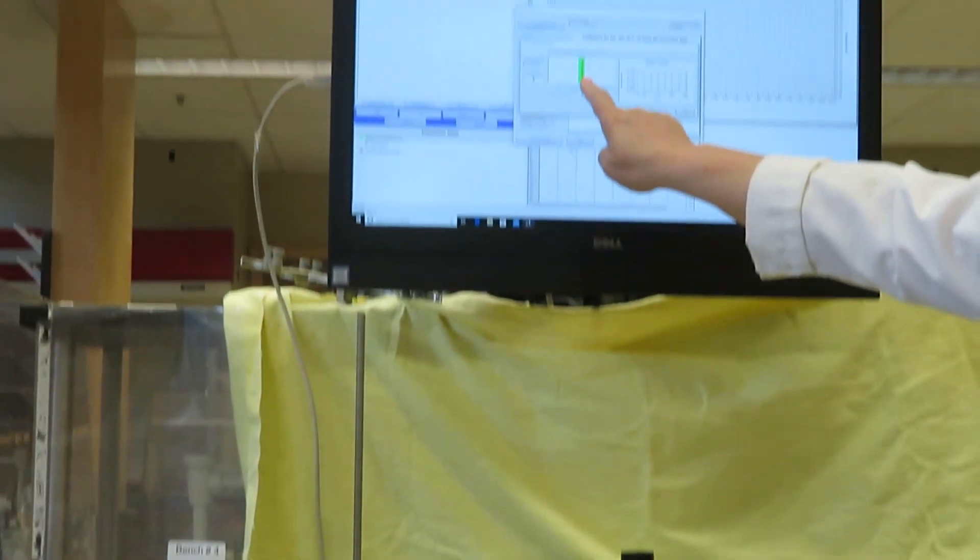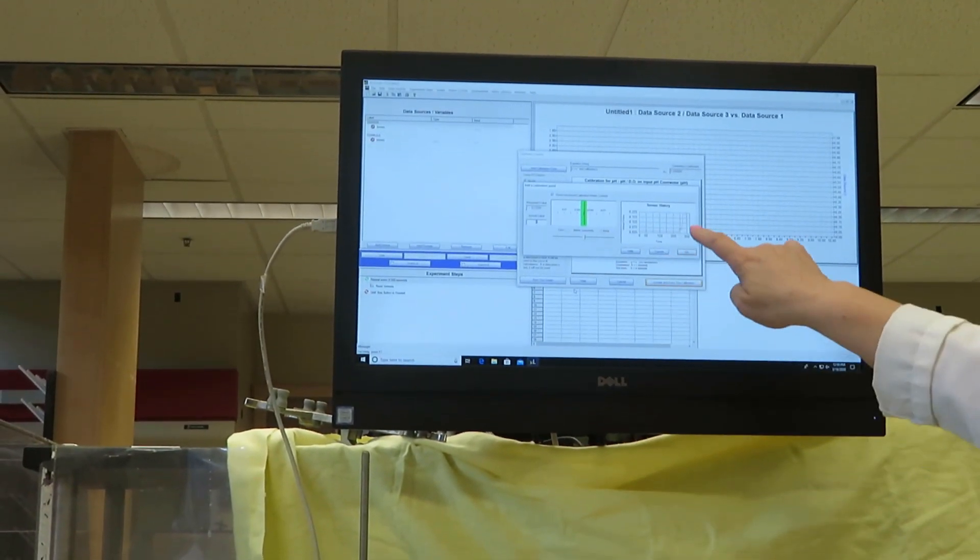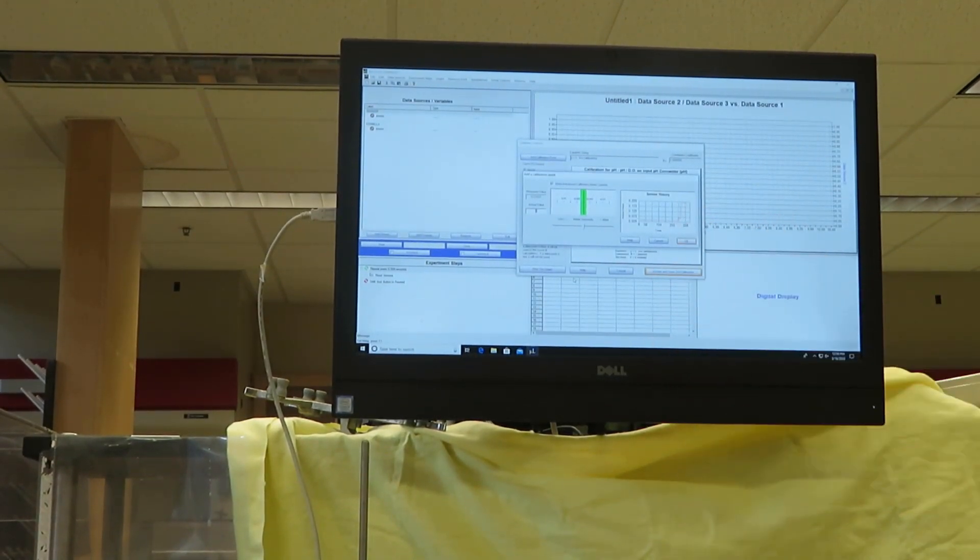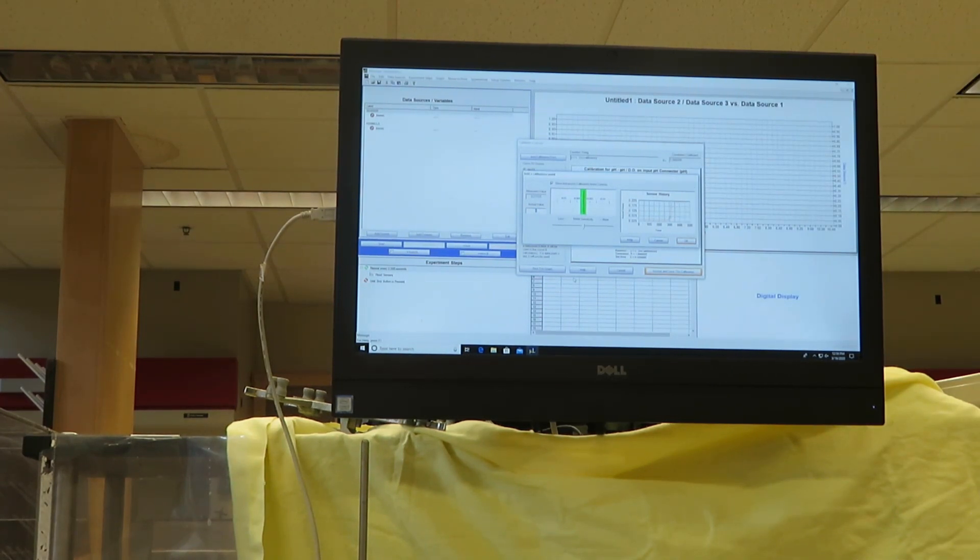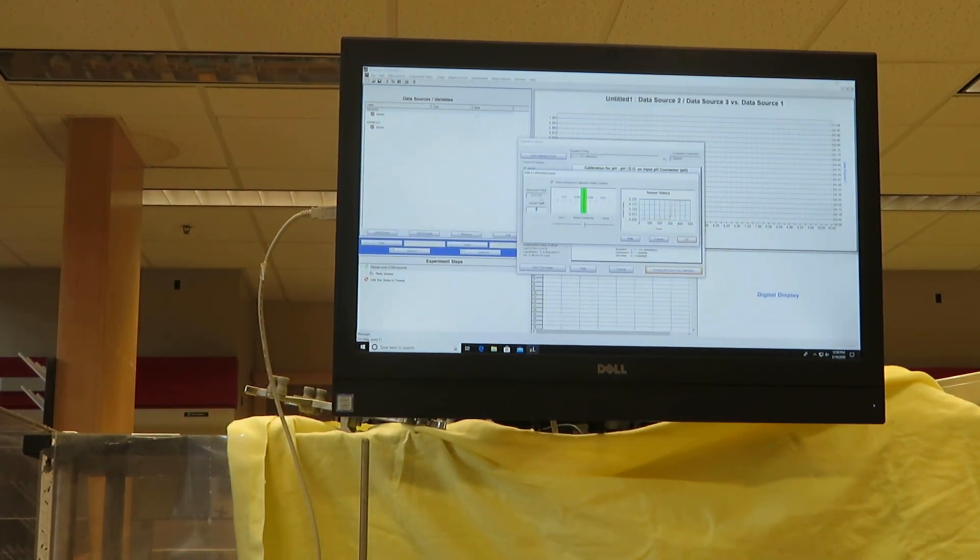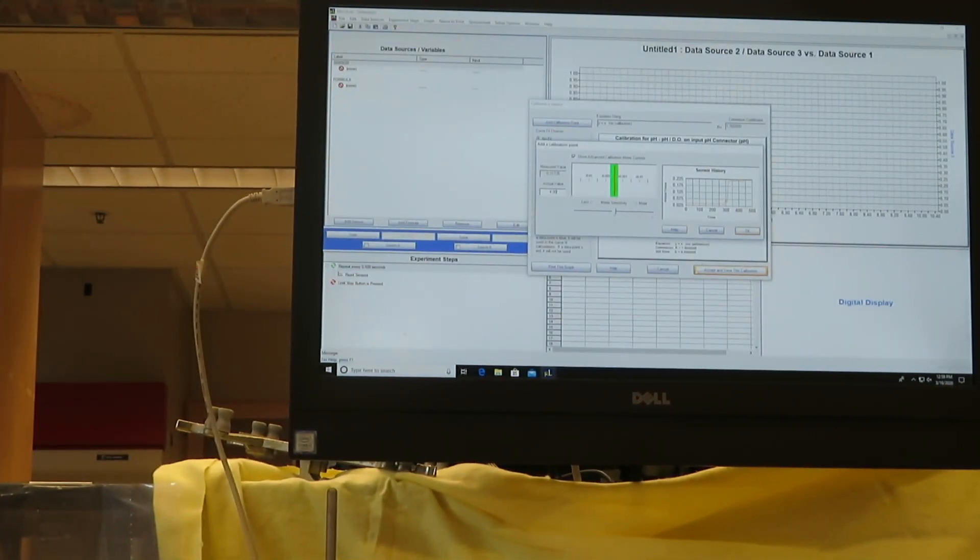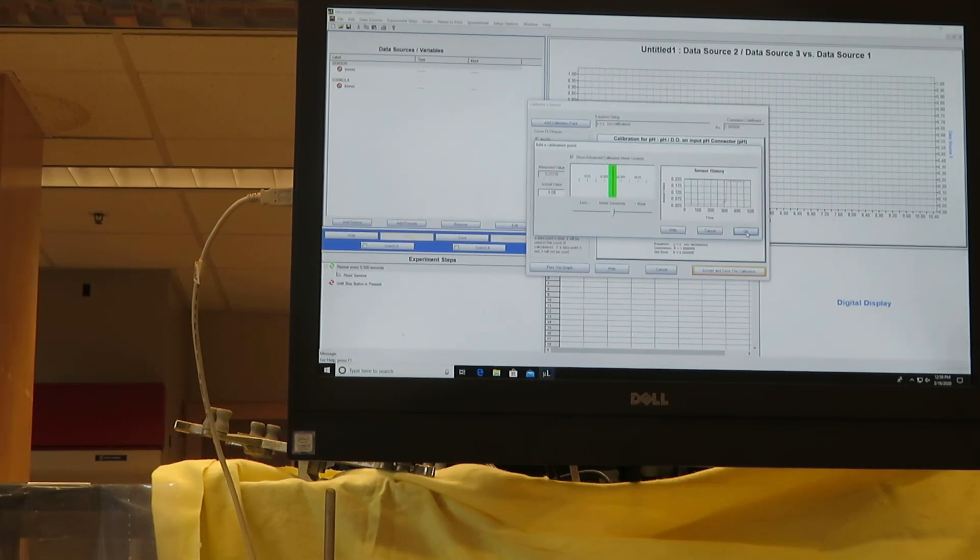What you see is that it's taking a moment to adjust. The millivolts has changed significantly. Let me give it a little stir to make sure it's leveling. At this point the measured value is not changing very much, so I can enter 4.00. That will be my first point.